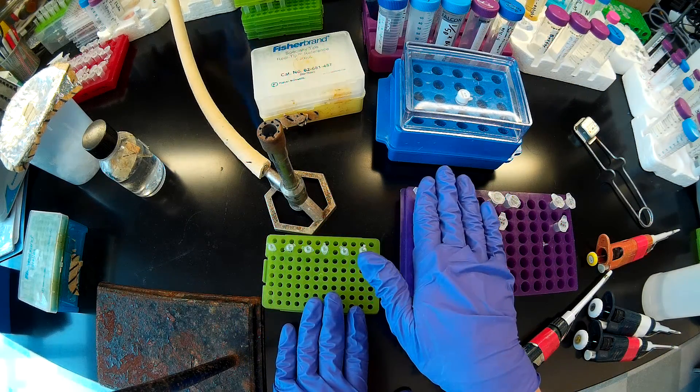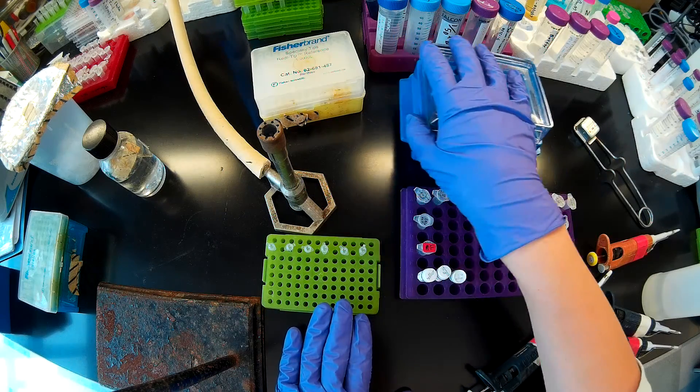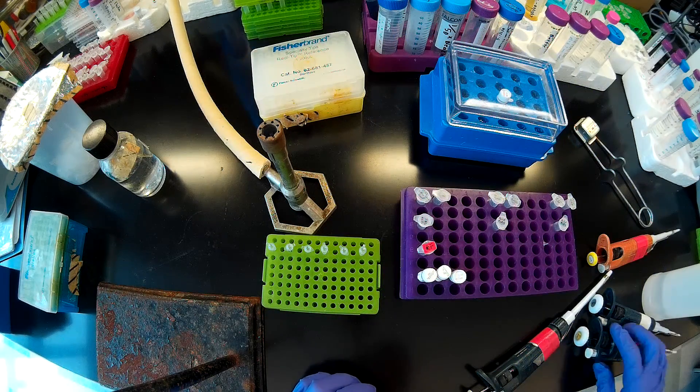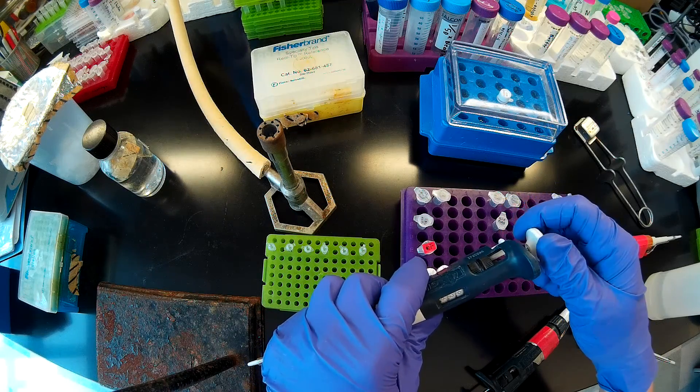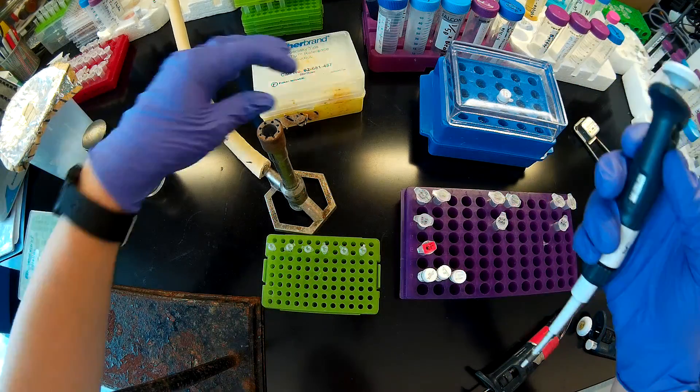To each one of these I'm going to add my reverse primer in order. I've already got the forward primer in there. So to each tube I'm going to add 2.5 microliters of the reverse primer.